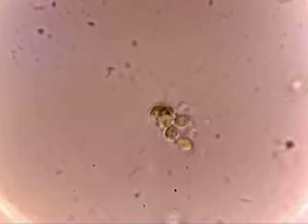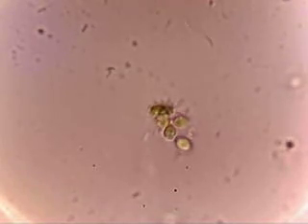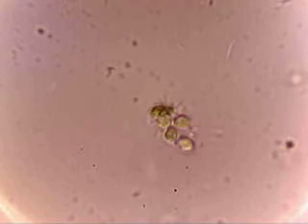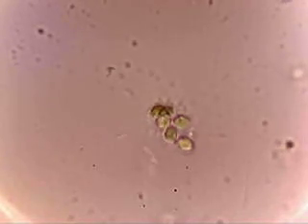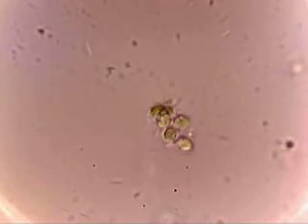Very interesting. It looks to me like a definite symbiotic relationship because it's non-destructive, apparently. The cyanobacteria appear to be very green and very alive, near as I can tell, and the bacteria are definitely alive and definitely very attracted to them. And you can see the way they're flocking. It looks just like a particle swarm effect. Interesting, huh? So there you go.